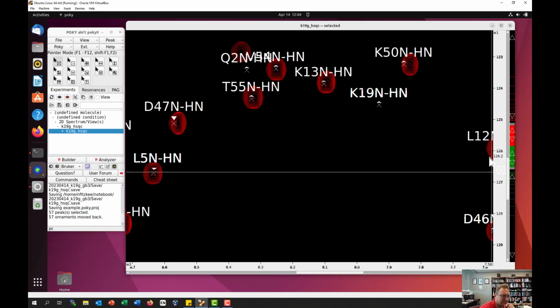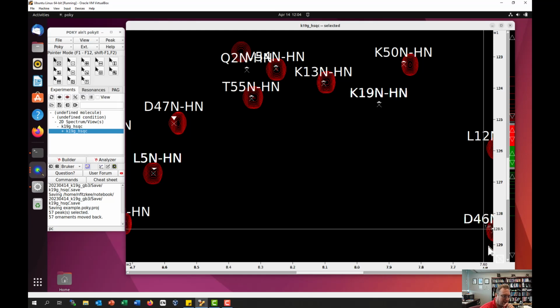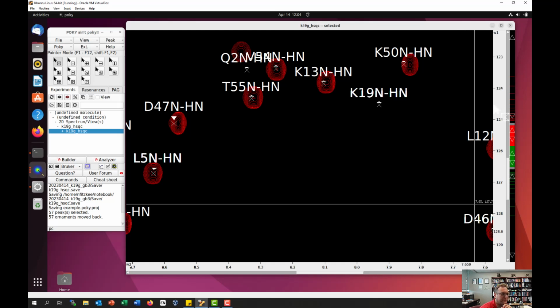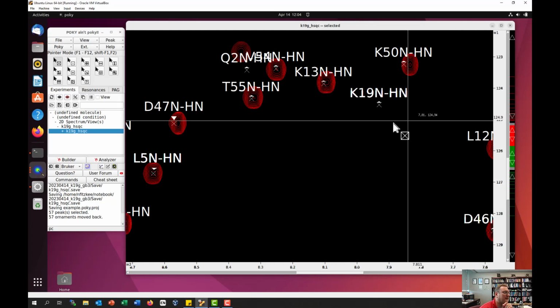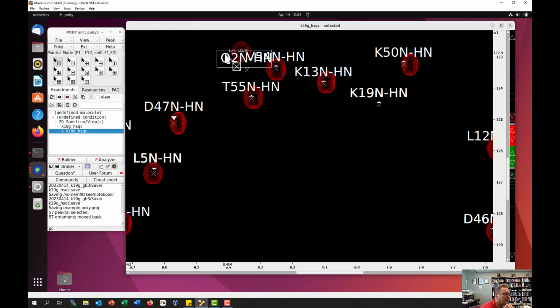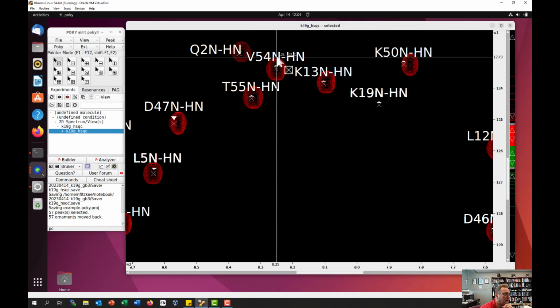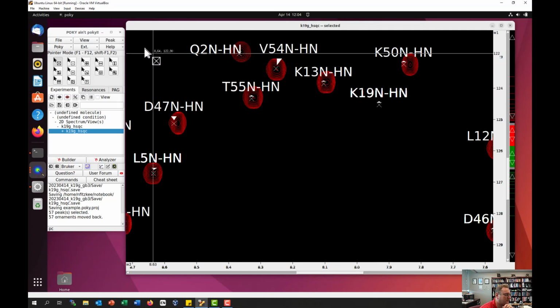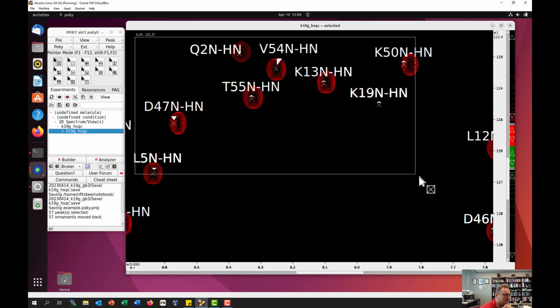And again, I'm missing some peaks here at the side, but that's why I'm not going to go to 7.6. My next step will be 7.7. So there'll be an overlap area where I can hit more peaks if I need to. But here again, looking here, so this is Q. Moving things to where they're sort of close, and now I can select it.